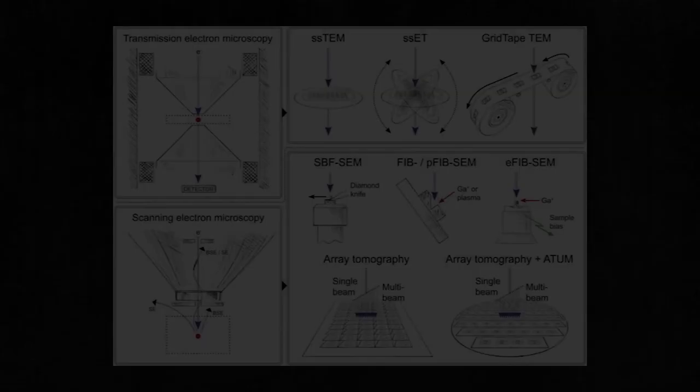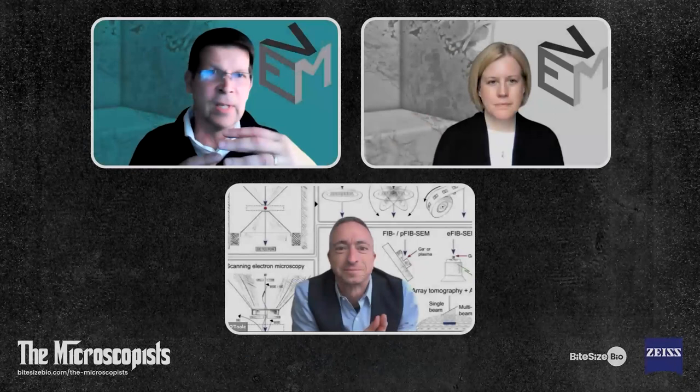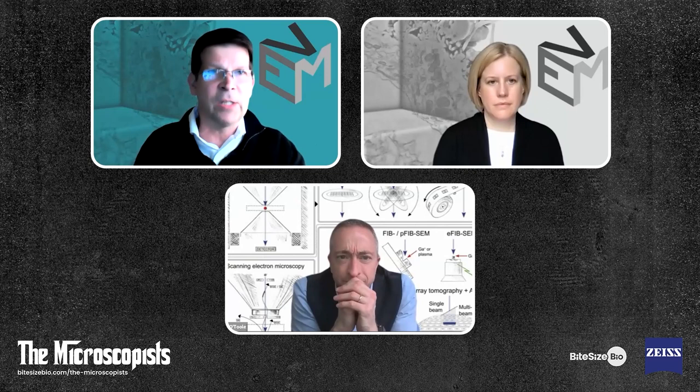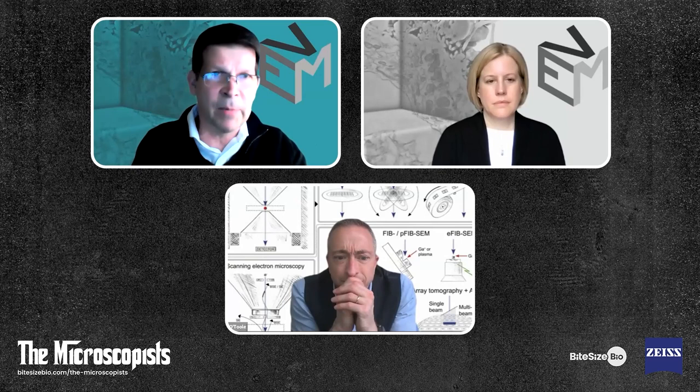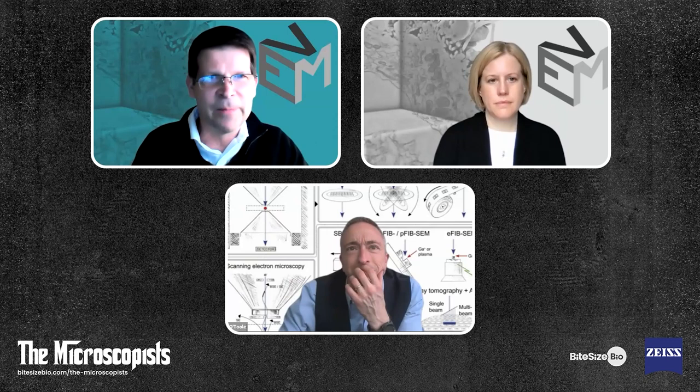Yes, exactly. You can do that on both the transmission electron microscope and the scanning electron microscope. These techniques now allow you to use ribbons in the TEM or the SEM. What's nice about array tomography is that it's non-destructive, meaning you can probe or interrogate those sections. You can image them in different types of microscopes, even light microscopes, and get chemical information using fluorescence and combine them back together. Then you can create these large volumes, which is the characteristic hallmark of volume EM: much greater than a micron, oftentimes tissues and whole organisms.